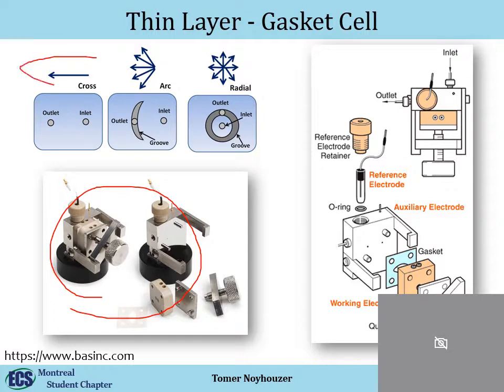So you can have a cross, and this is the gasket of the cross, and here you can see you have two electrodes, those two dots, and it will reach one electrode, the other electrode, and perform the measurement. So this is a simple measurement, but let's say you want to measure with a couple of electrodes. So you'll buy one of those blocks that have three electrodes, so you'll have an electrode here, an electrode here, and an electrode here maybe. I'm saying three, it could be more.